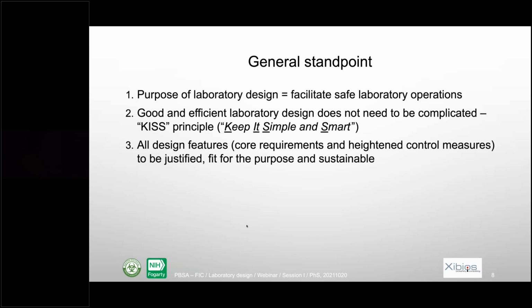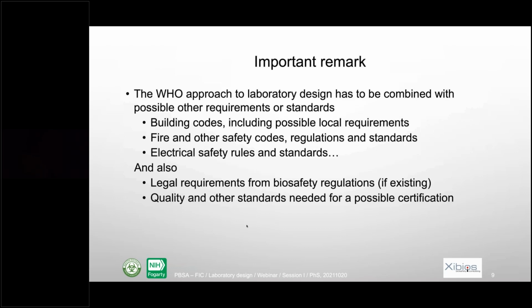Also, all the design features need to be justified. And how is that justified? Mainly by risk assessment. And they should also be fit for the purpose, so respond to your needs. And they should be sustainable, meaning that it's not just for today, tomorrow, it should also work in the long time.